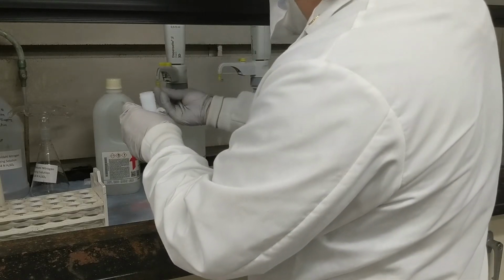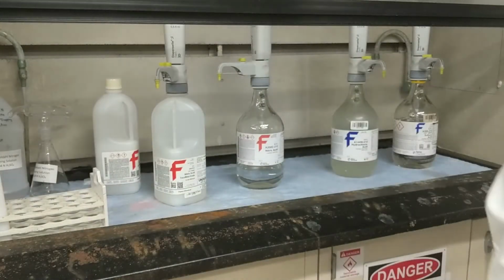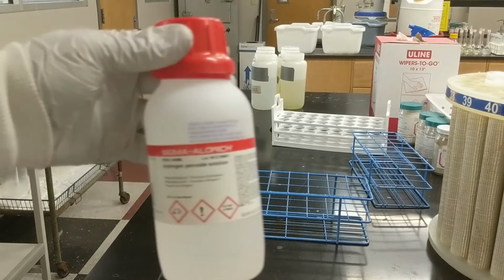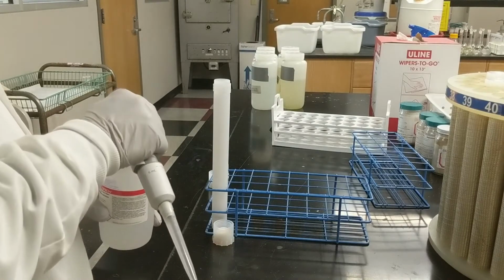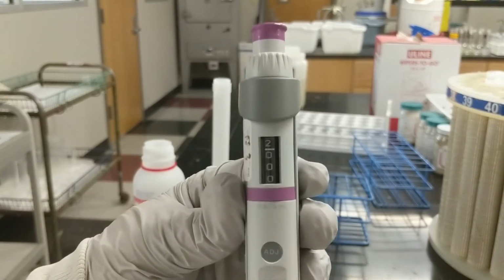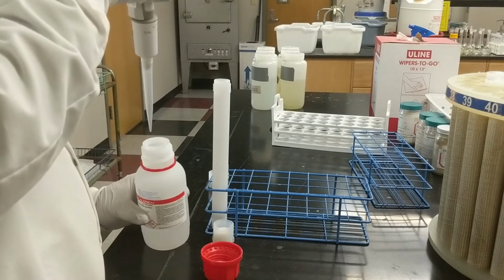For our third digest, we do 5 milliliters of nitric acid and then 2 milliliters of hydrogen peroxide. This is an oxidizing digest, and so it is a little bit more powerful, but not quite as harsh on our tubing when we get to the analysis stage.